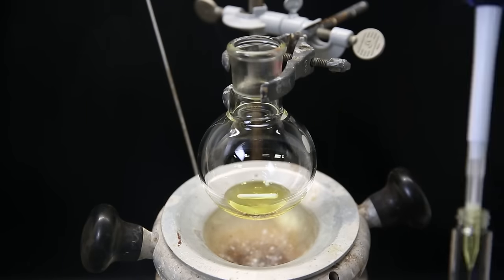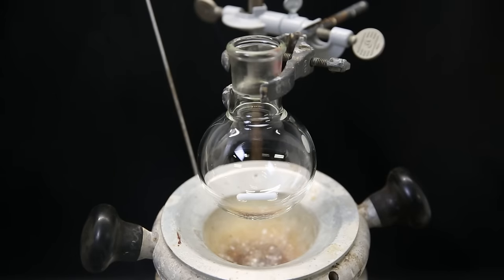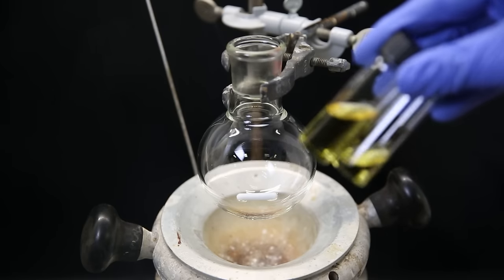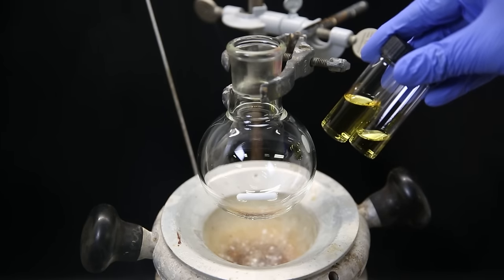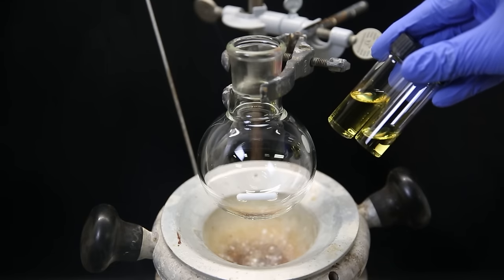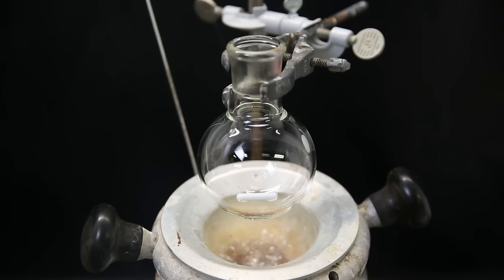So I take it all up with a pipette, and divide it up between two vials. I send one of the vials to someone else, who does have cats, that have previously been responsive to catnip. Since some cats do not react to the compound, it is better to try it with cats who are known to be reactive. Also, I'm not going out to test it with random cats, because the material is impure, and I don't want to look like a weirdo going up to cats with a vial. Please enjoy the following cat footage.